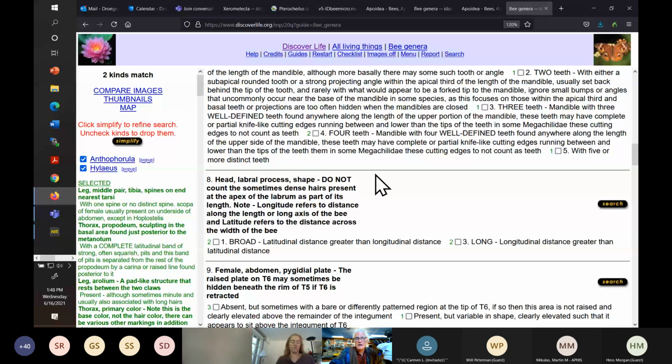You'll just snap something off. But you can rehydrate it. Even after rehydrating, and by rehydrating it usually means placing them in some kind of enclosed plastic container, floating on top of a piece of styrofoam with hot water below it, they're often reluctant in particular to move the mandibles at that point, and you'll often end up harming the specimen. It takes a little bit of work to do that.